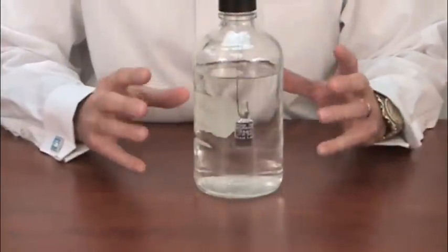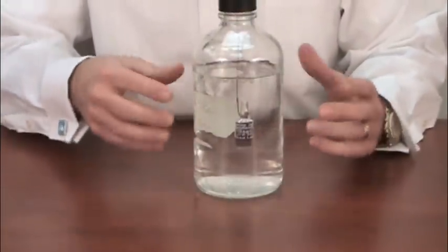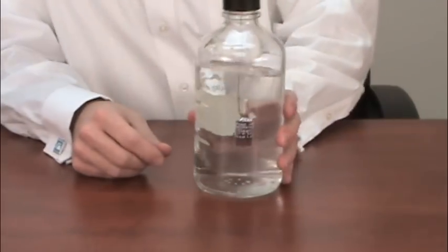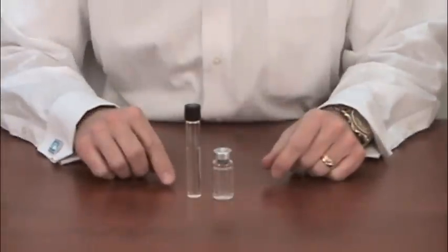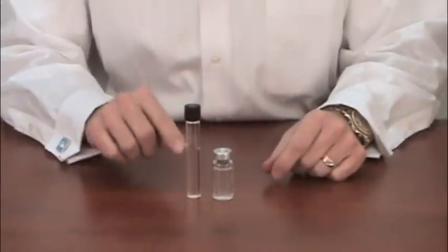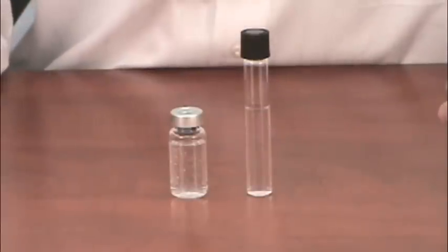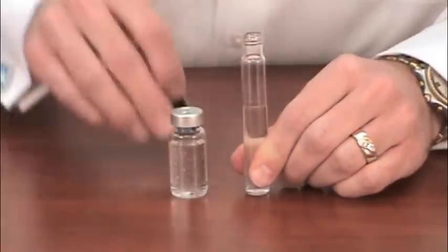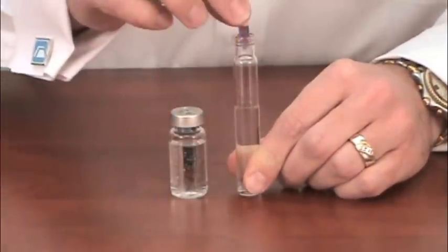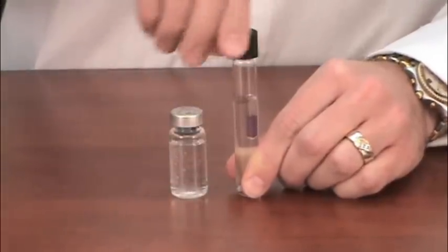Placement of the biological indicator when we have larger volumes is critical because there will be a temperature gradient within this mass of liquid. If we consider smaller volumes, there's not going to be as much of a temperature gradient and suspending the biological indicator is not as critical. With smaller volumes, we can place the biological indicator without using a copper wire and simply drop the ProSpor ampule directly into the liquid volume.